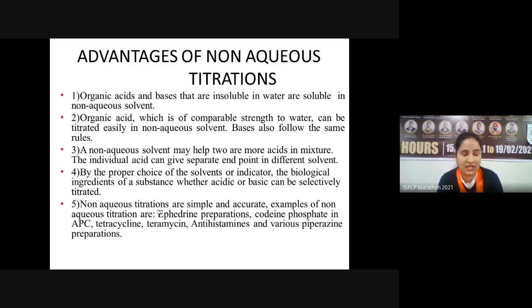The fifth point is that non-aqueous titrations are very simple and very accurate. The examples of non-aqueous titrations are ephedrine preparation, codeine, phosphate in APC, and many more.